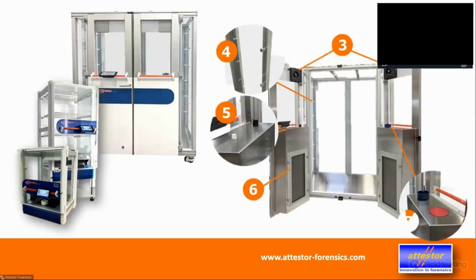We can actually produce that with just legs on it and a bit less high, but still on a typical 80 or 90 centimeter bench, the uppermost level is pretty high up. So you have to have tall students then for that one. But he wanted it like that, so we created it. The large one is designed a little bit different. It has a two-winged door, so you don't need so much space in front, and the opening is approximately a meter, so pretty easy to access.